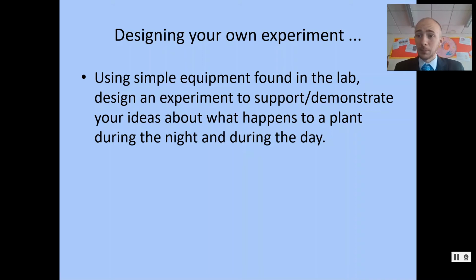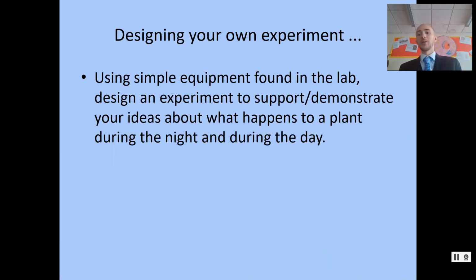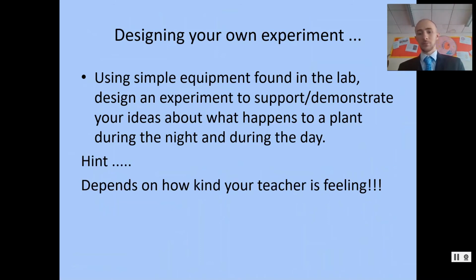And we're going to set it up to find out what happens to a plant during the night and during the day. So you need to design an experiment that would enable you to find that out. And hopefully what you should find out is what we just talked about. But you might find something different, in which case we've just disproved one of the laws of science, that's fine.